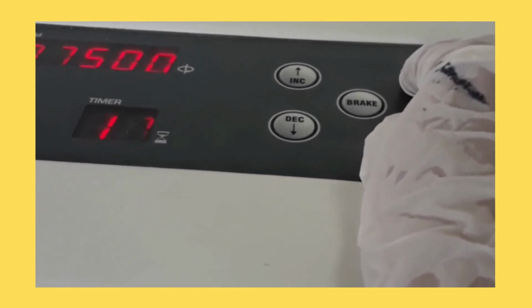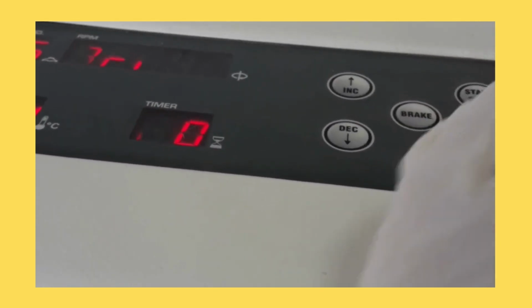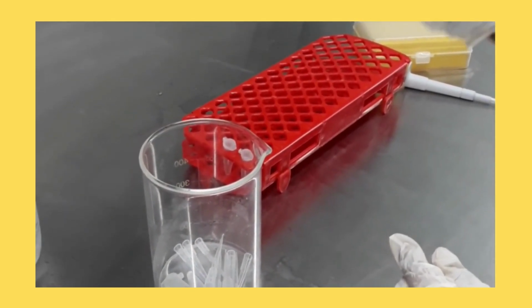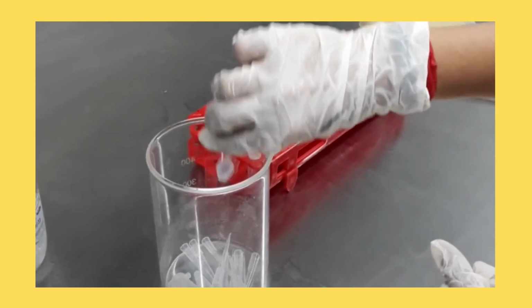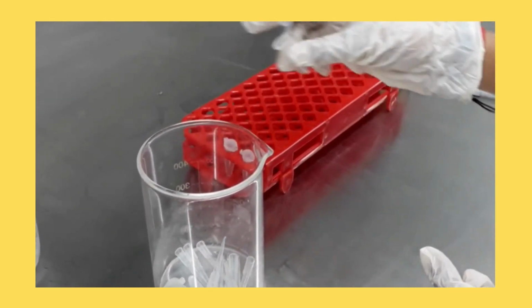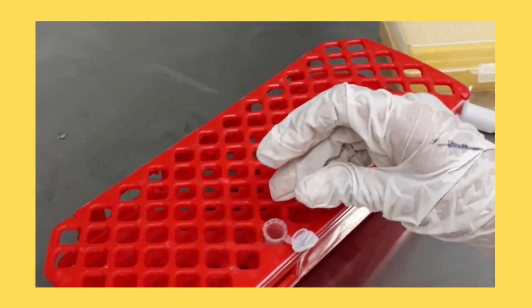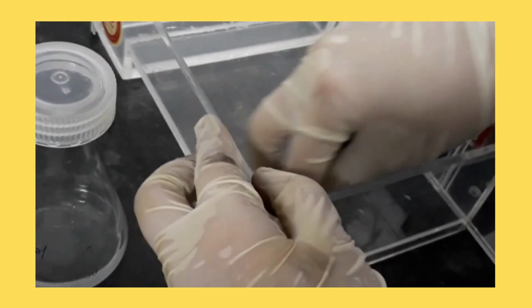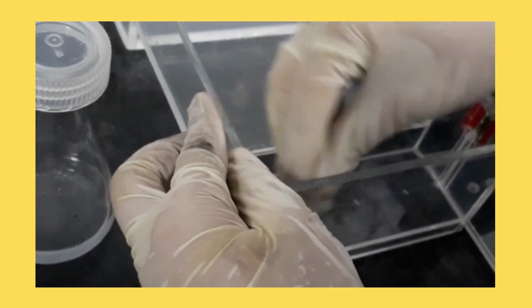Now centrifuge again at 7500 rpm for 10 minutes at 4 degrees Celsius. For drying, we have to discard the supernatant and invert the tube on a clean tissue. Dry the pellet by incubating for 5 minutes. Clean the agarose gel electrophoresis apparatus with isopropanol.